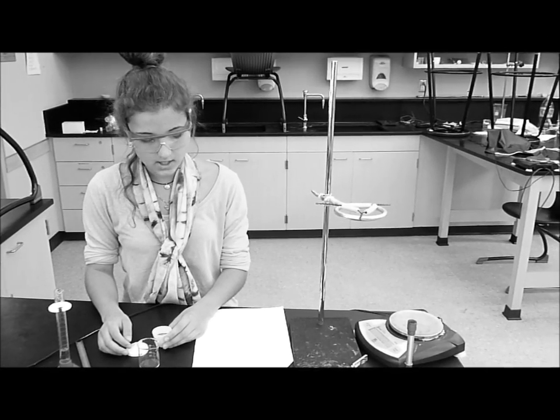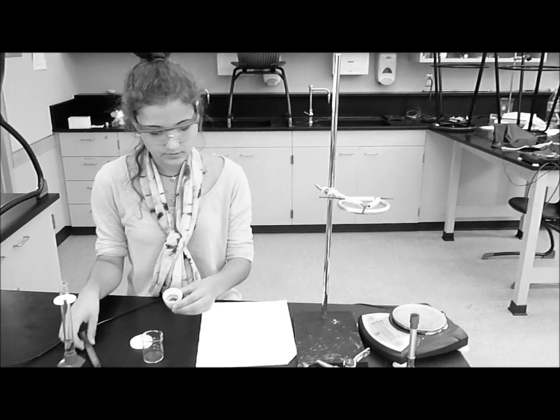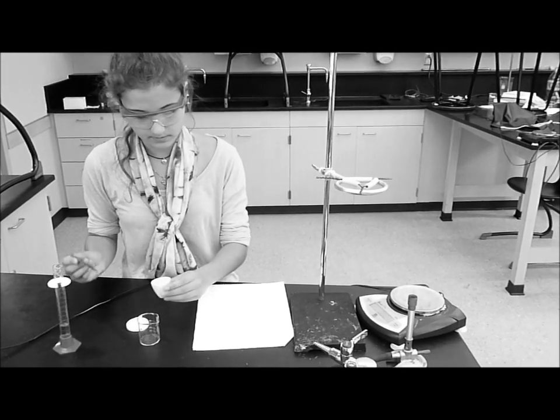Once the sample has achieved constant mass, transfer the brown solid to a clean and empty 50 milliliter beaker.